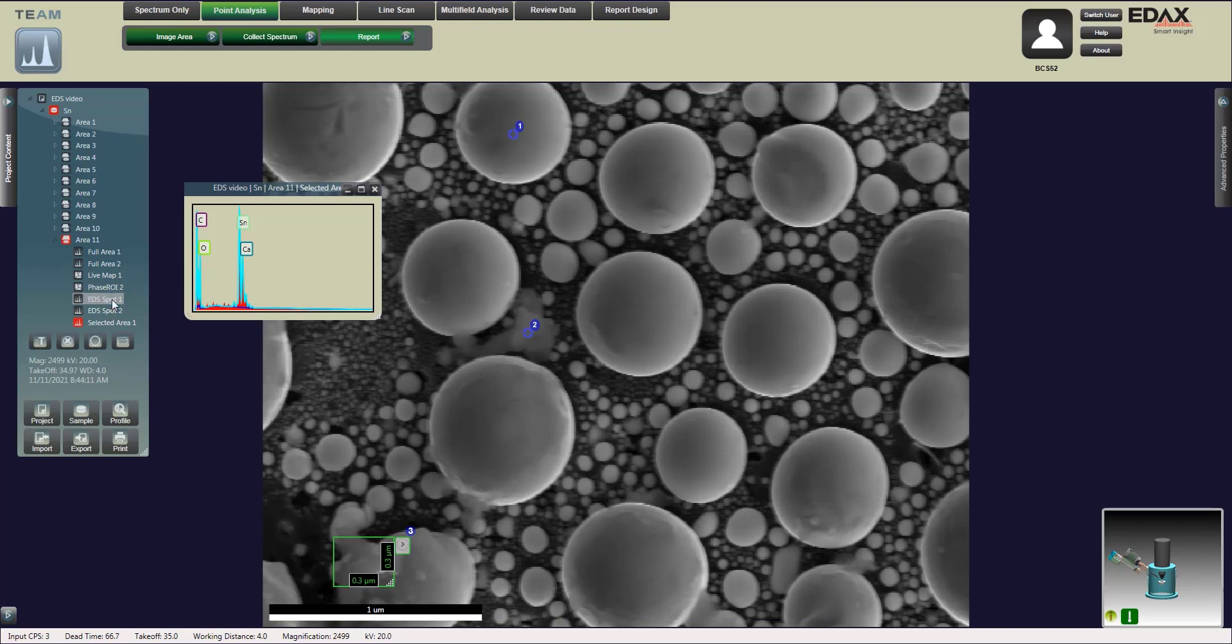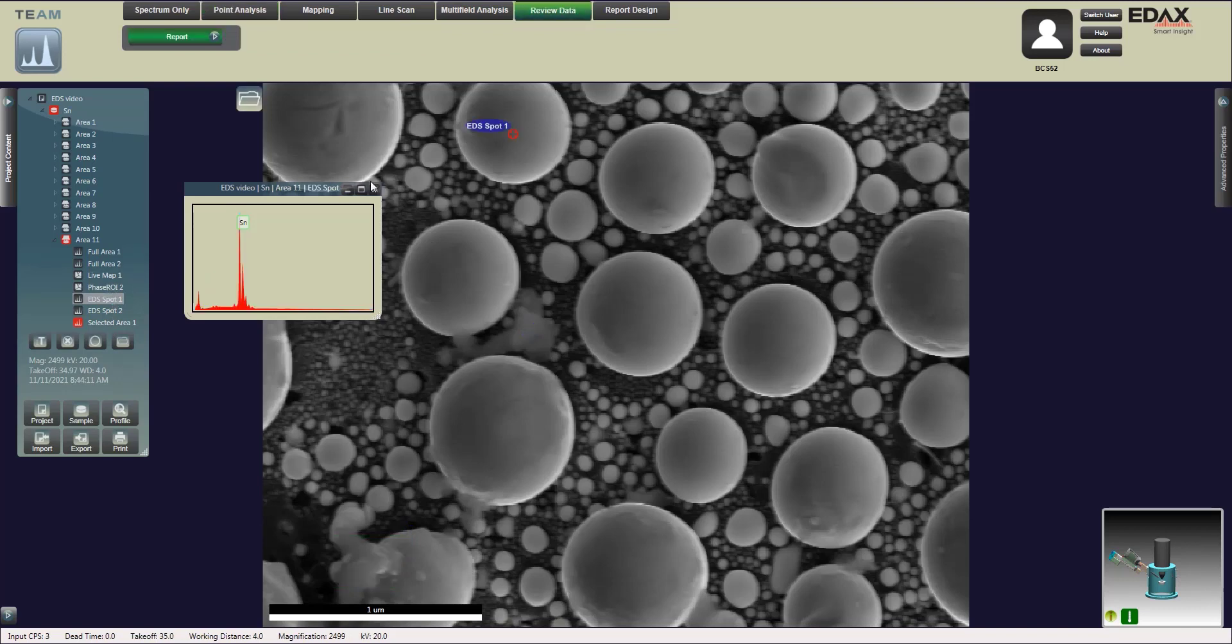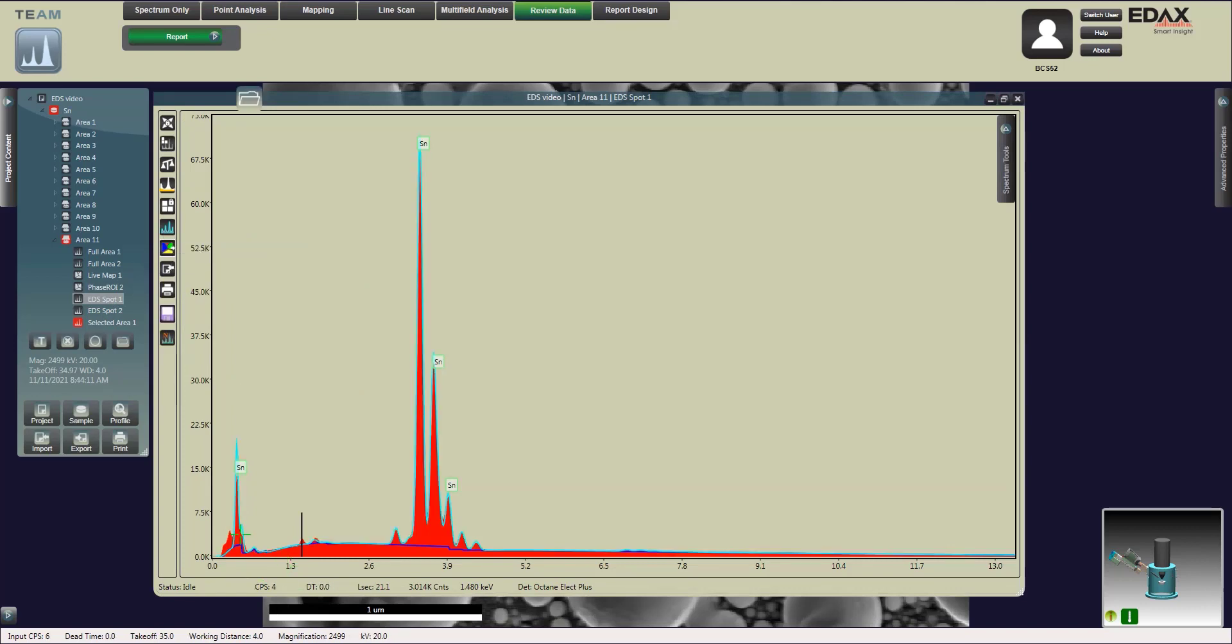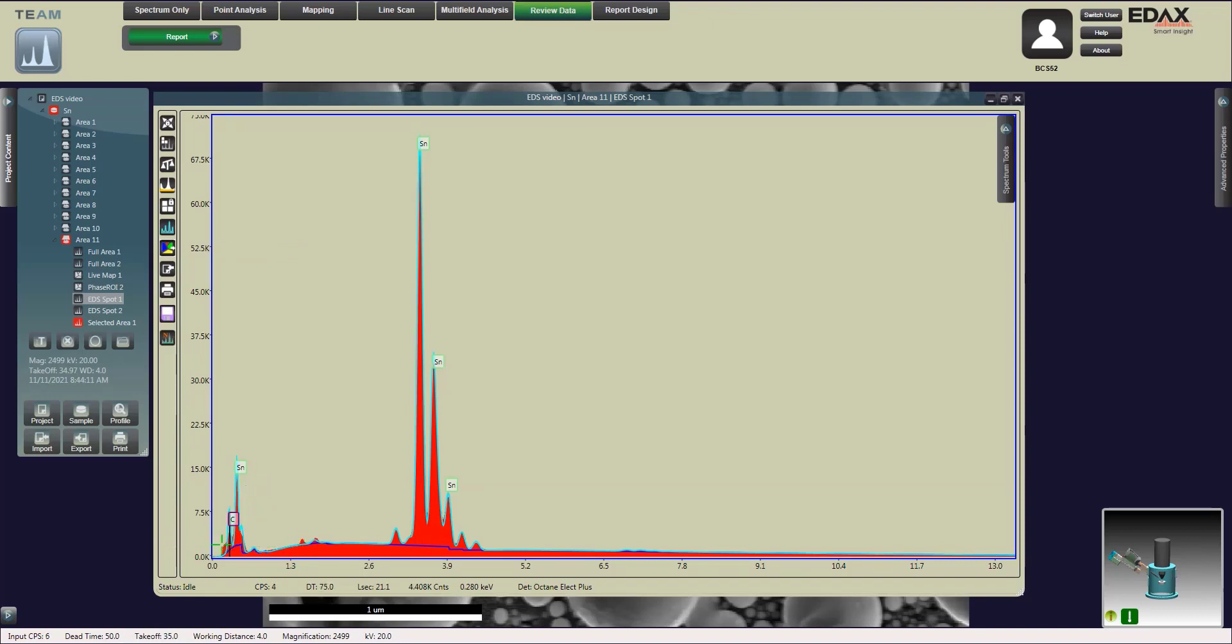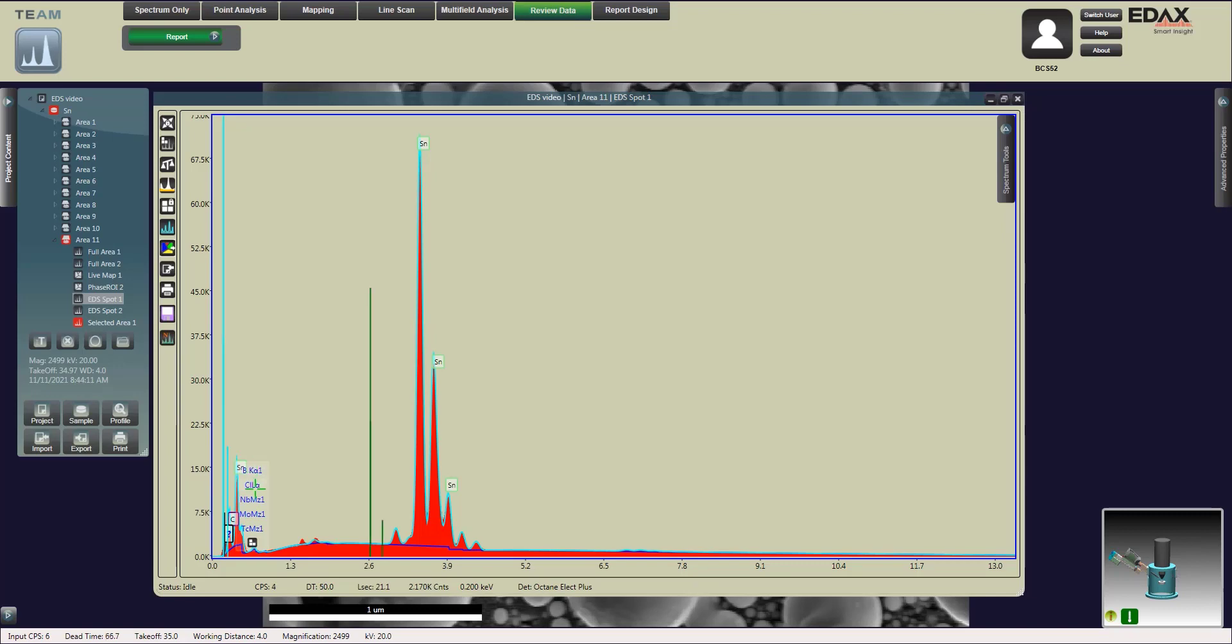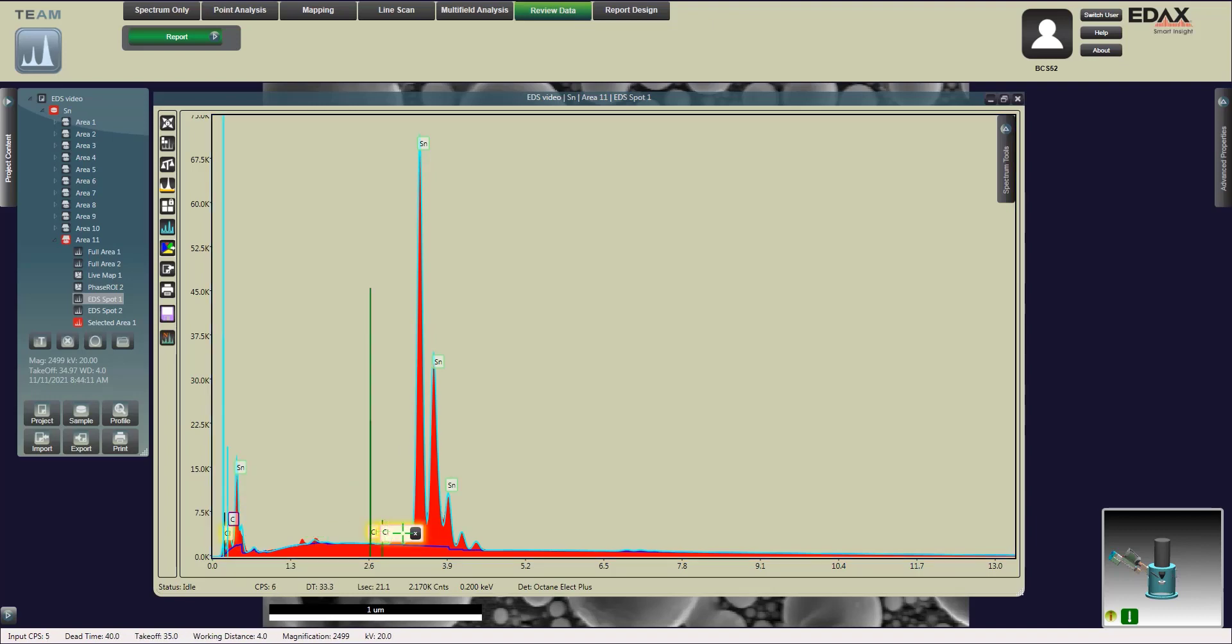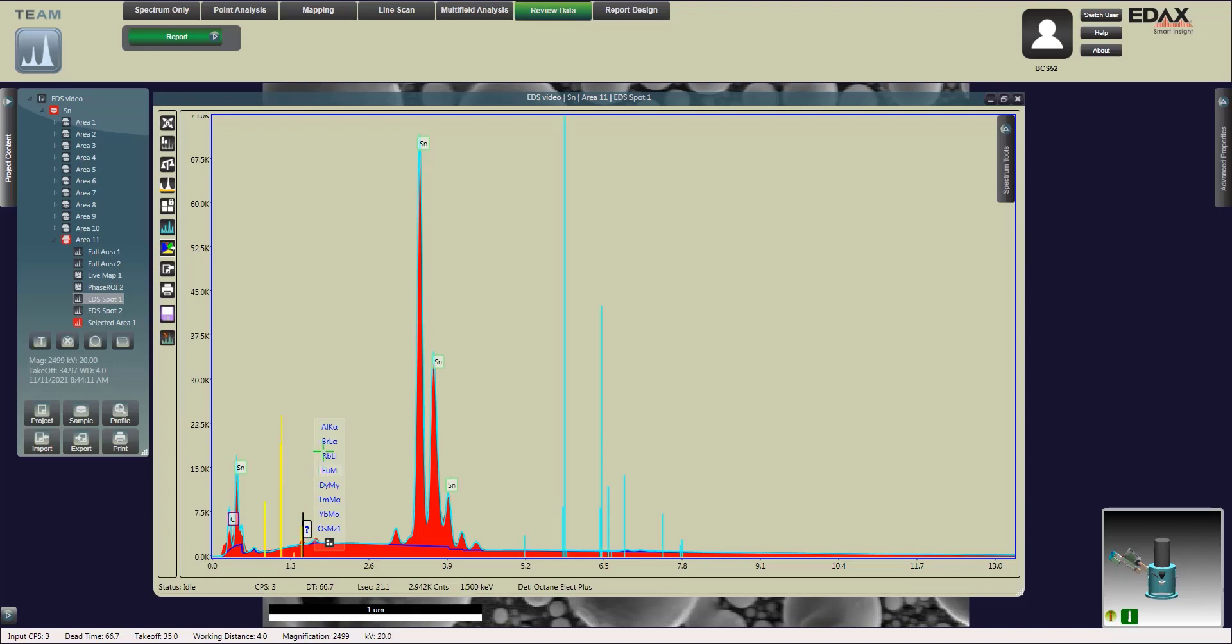Now the scan's complete. I can go ahead and look over the data and make sure the processing fits the background and the peaks correctly.